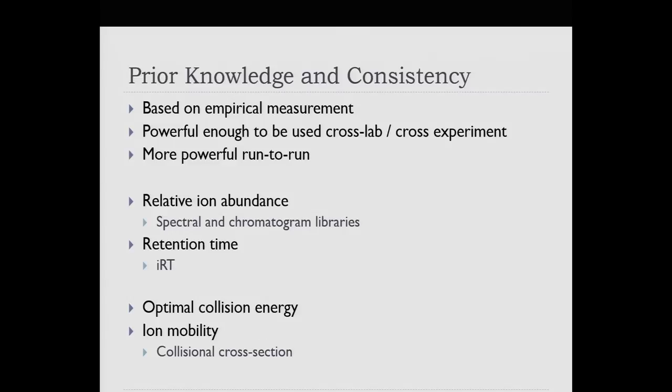But that also means that retention time is incredibly stable, run to run on a set of measurements taken on the same instrument. And then also optimal collision energy. As Ariel explained, we can optimize our method further to use the optimal collision energies to produce the highest areas.